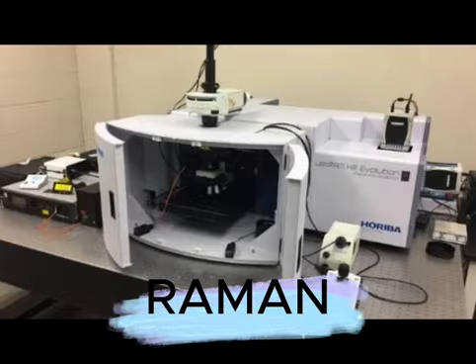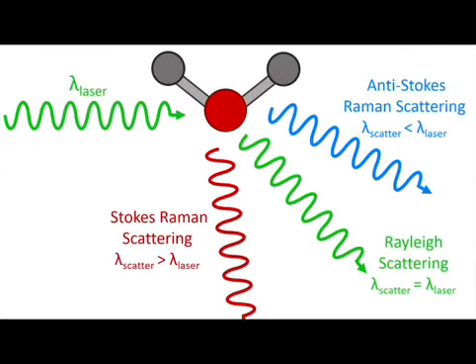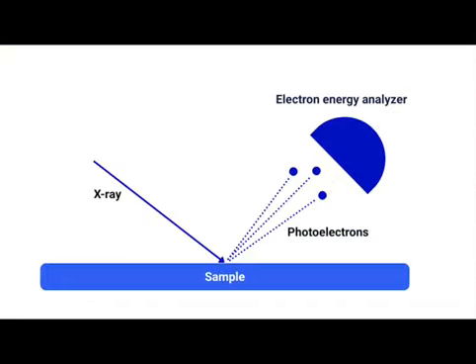Raman Spectroscopy. It shines a laser and measures the scattered light to probe vibrations. What we get is the molecular bonding, carbon quality, stress strain, etc. Another important technique is the XPS, X-ray photoelectron spectroscopy. It gives us information about the surface elements and their oxidation states.